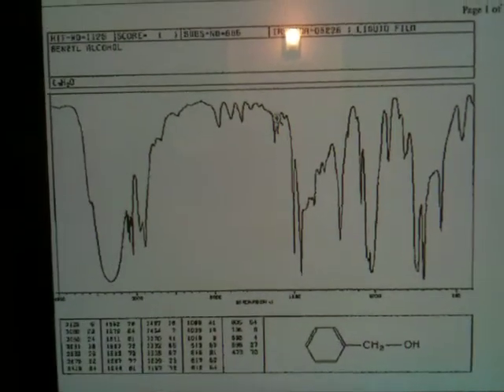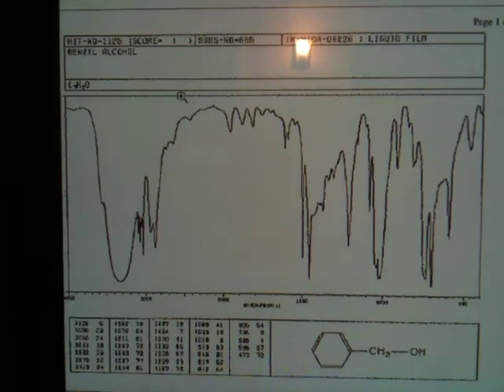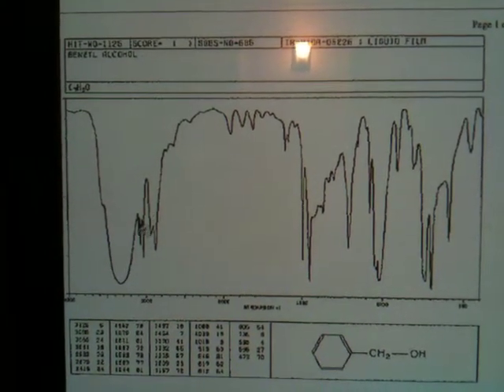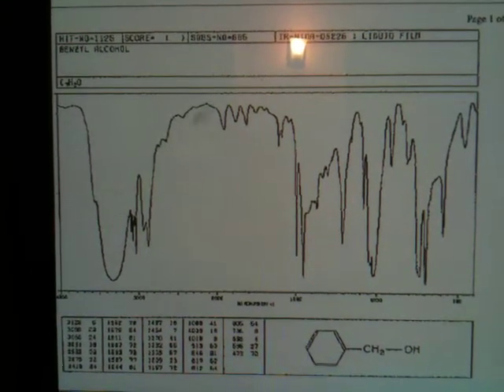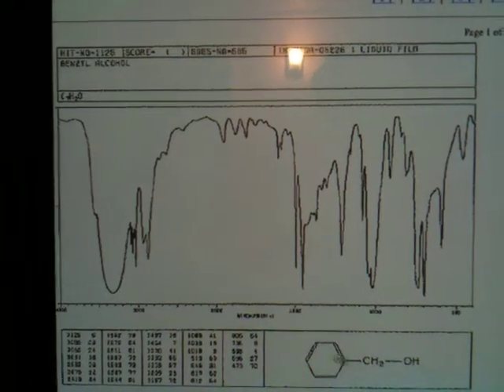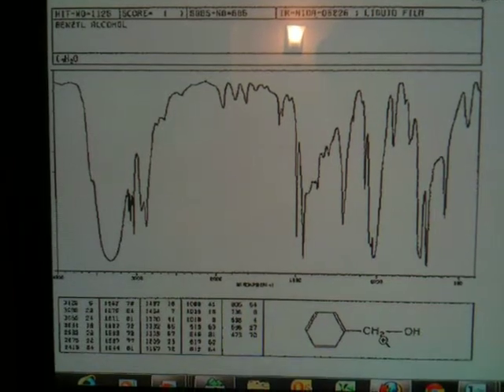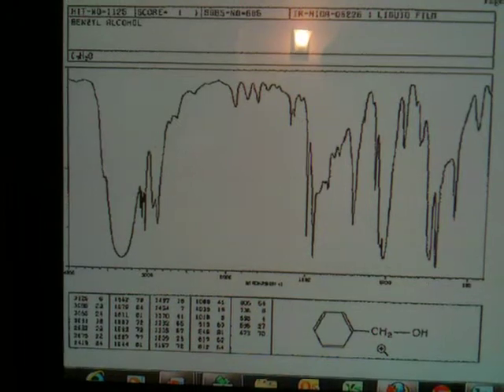And normally what you would say is, I've got a benzene ring. So everything would fall in place here. The formula being unsaturated with an unsaturation of 4. We know we have an alcohol. We know we have sp2 hydrogens. That's kind of a clue. It might be aromatic. We do see this peak that could be an aromatic, but these overtones are what really tell you that you have this ring. Now think about this. A benzene ring with an alcohol and some sp3 hydrogens has a formula of C7H8O. Again, sit down and draw isomers. You're going to find there aren't that many isomers.